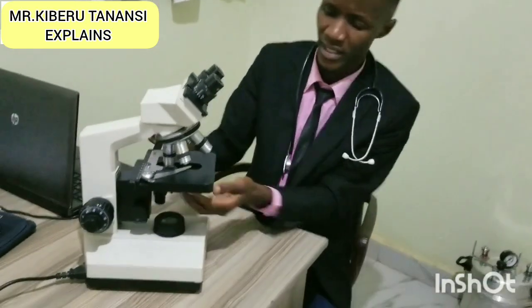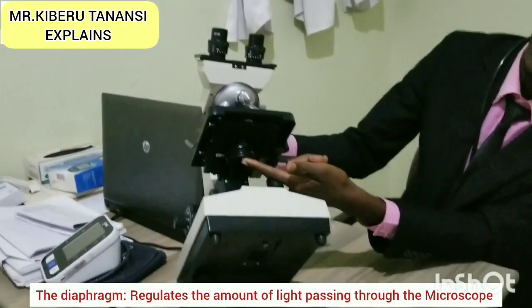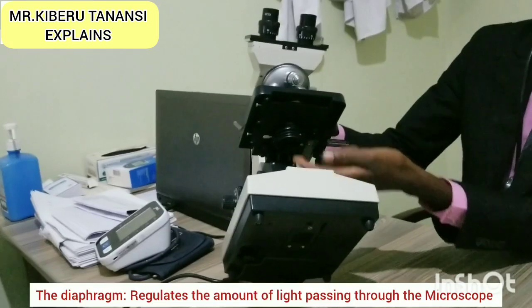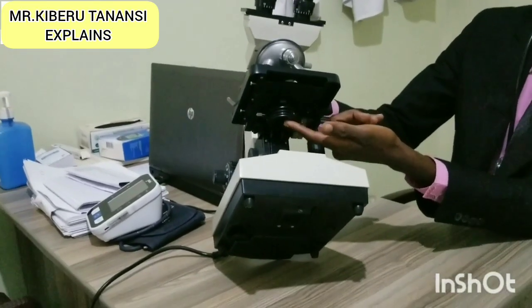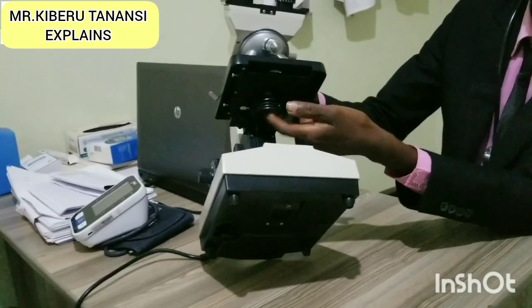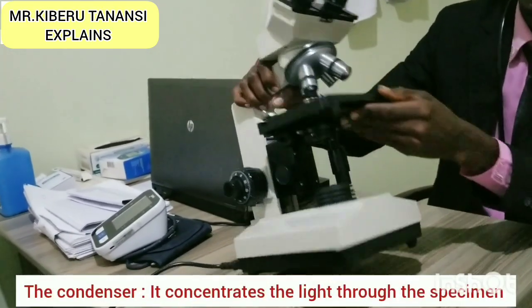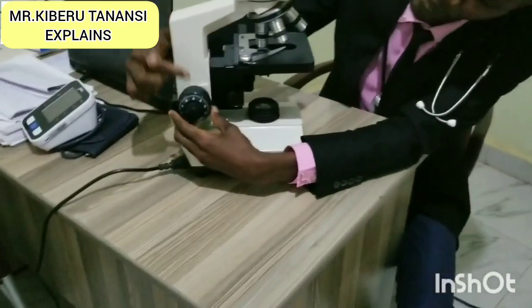Apart from that, down here we have a diaphragm. This diaphragm regulates the amount of light which is entering through our microscope. So the diaphragm is here, and below the diaphragm inside you also have a condenser which condenses light onto the stage. From there we have this big part here.